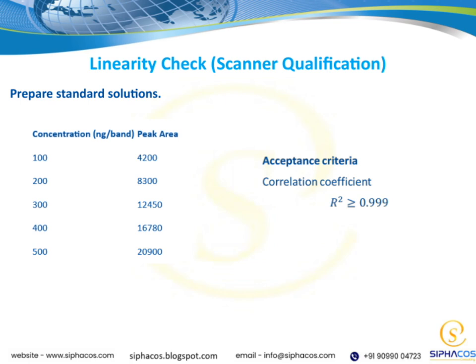quantitative results. By regularly conducting these checks and preparing standard solutions accurately, we maintain the integrity of our data and ensure our entire process remains reliable. This step ties directly into our overall goal of quality assurance in our analytical procedures.